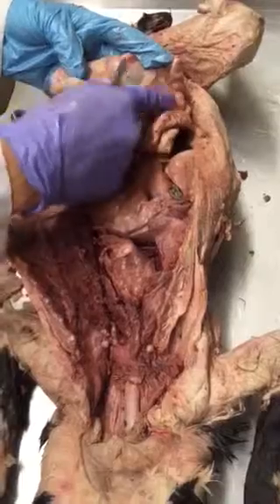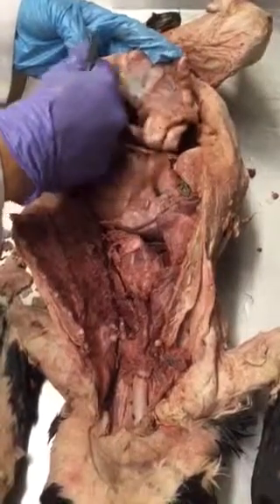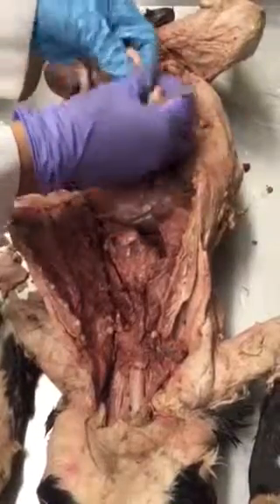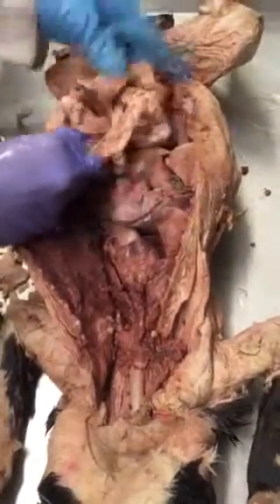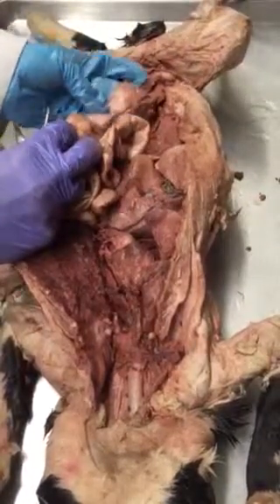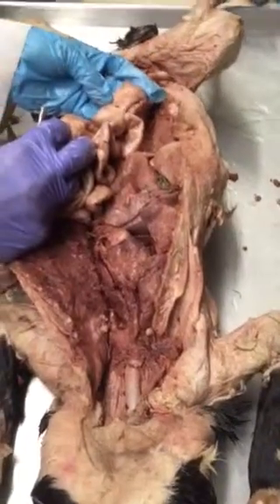And this membrane? The flower. Somebody said it. Mesentery. What part of the intestine am I on generally? Small intestine. What part of the intestinal tract am I in here? Large.